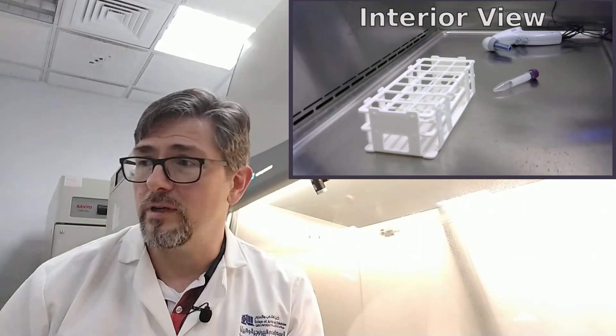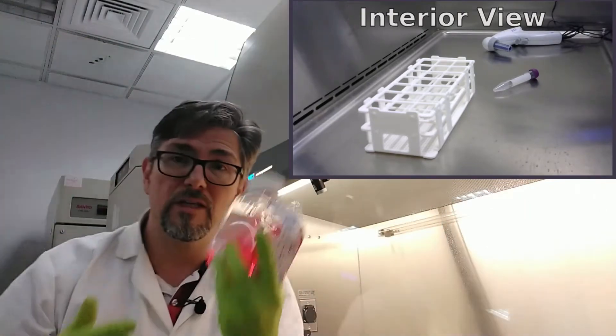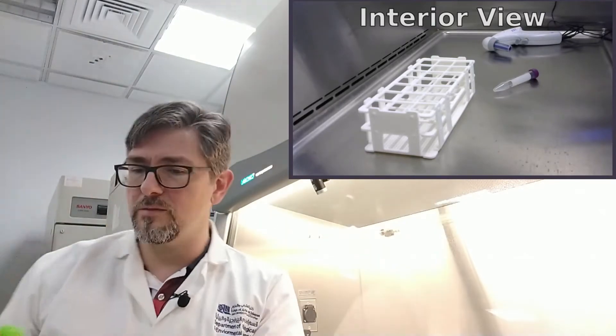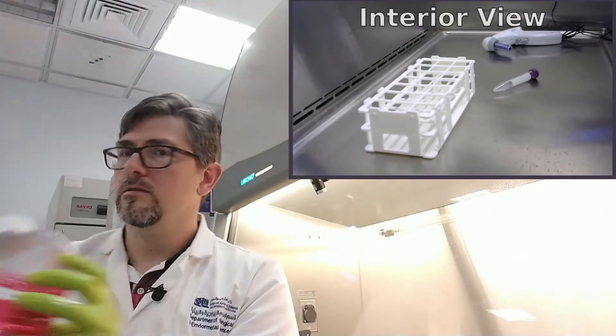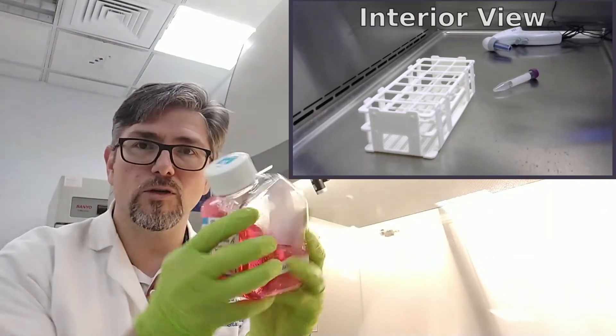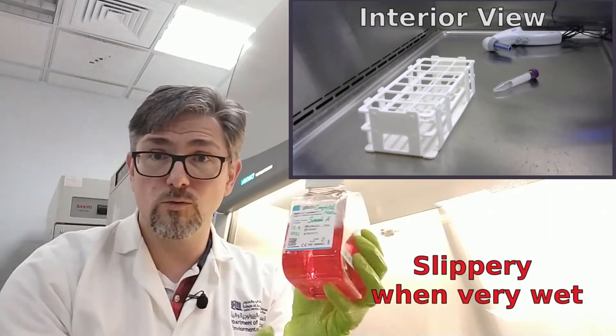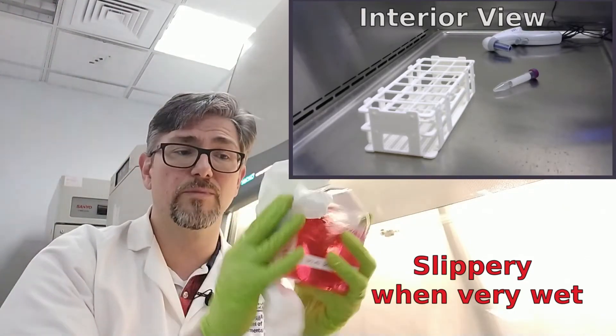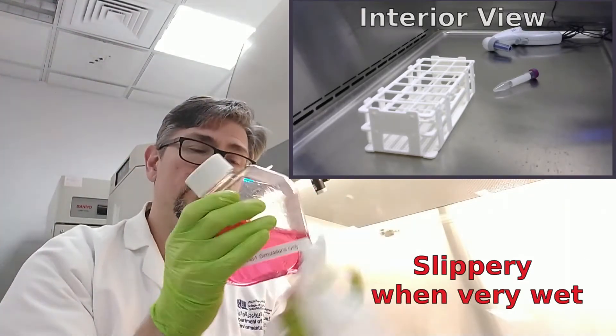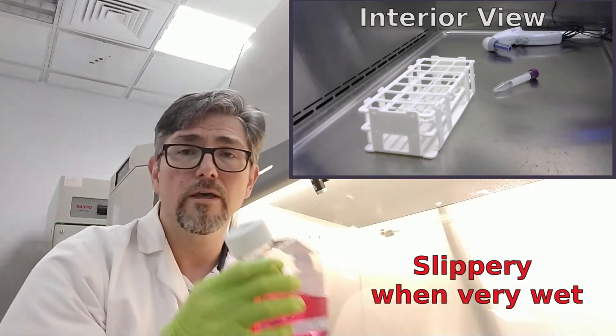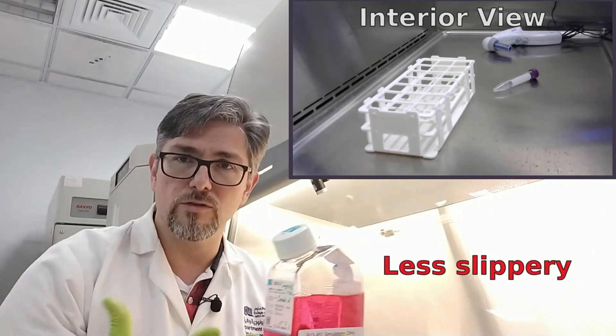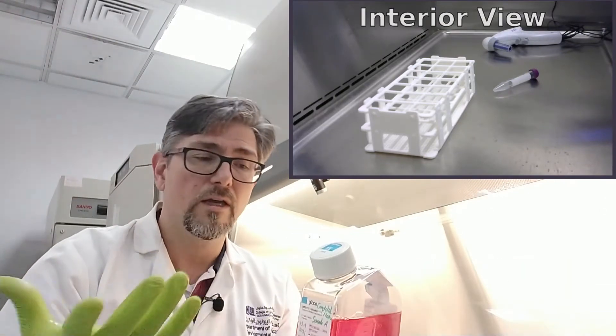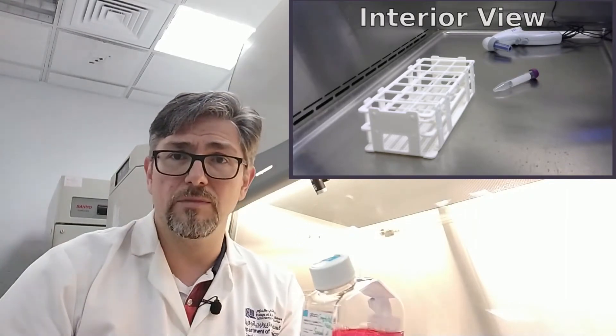Now, for other components, like media bottles, for example, these are fairly large, and once you spray them down and they are completely soaked, they can be quite slippery. And this is where I would take a paper towel and wipe it down. So, start at the top, near the opening especially, and then wipe down the sides. You're not trying to remove all the ethanol. You're simply trying to make it a little easier to handle. So, you're spreading the ethanol evenly over the surface, and then we're going to allow it to just evaporate once inside the BSC.